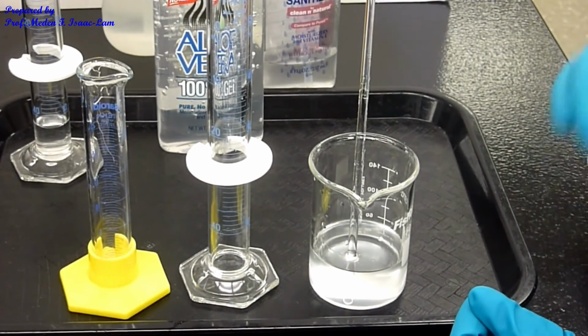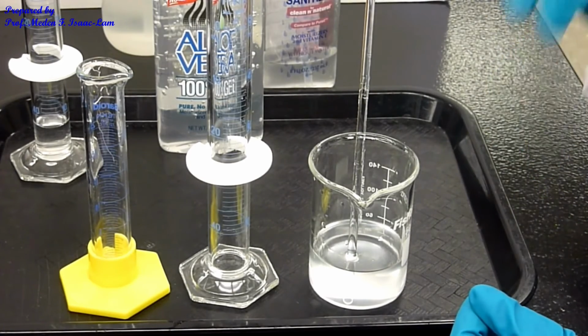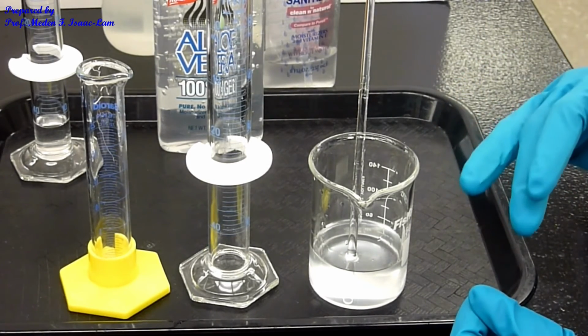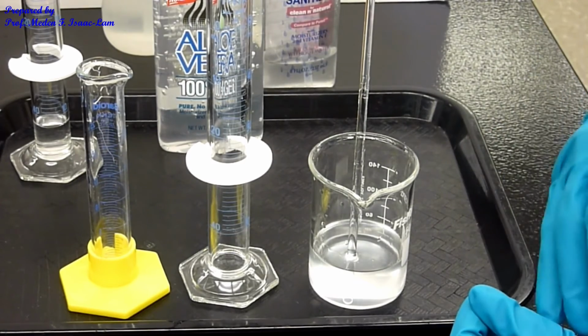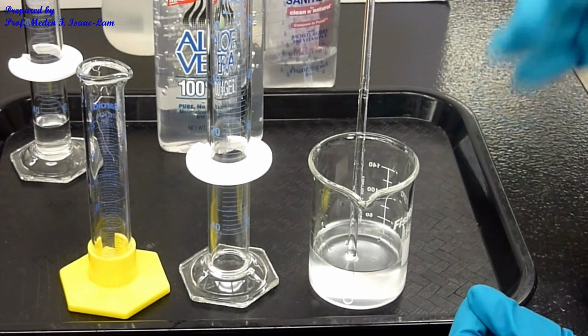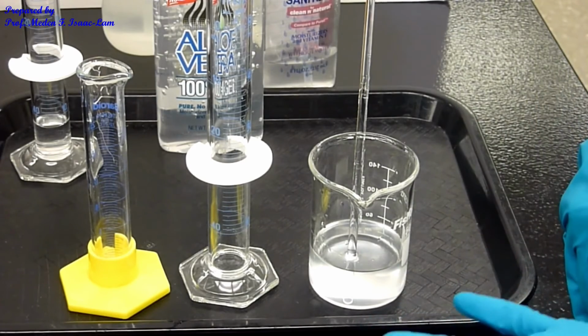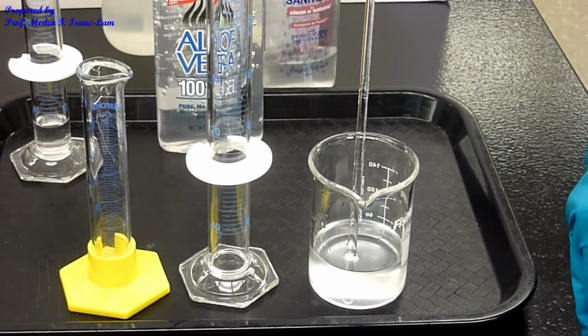As long as the amount of ethanol you're putting in is still within the minimum amount, which is 60%, don't go below that. You can always go higher in terms of the amount of ethanol, but don't go below 60% because it will not be effective as a disinfectant.